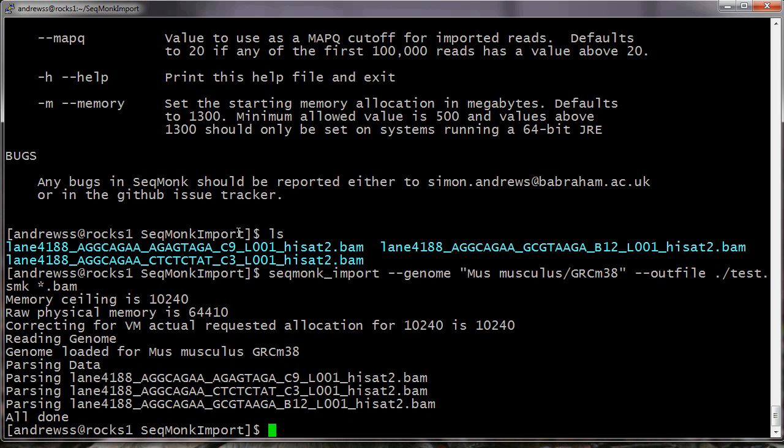OK, so the import's now completed. In this case I didn't get any import warnings when these files came in, but if any of those had been produced, then after the parsing line for each individual sample, I would have got another line telling me how many import warnings there had been for that sample. In this case that's not something I need to worry about.